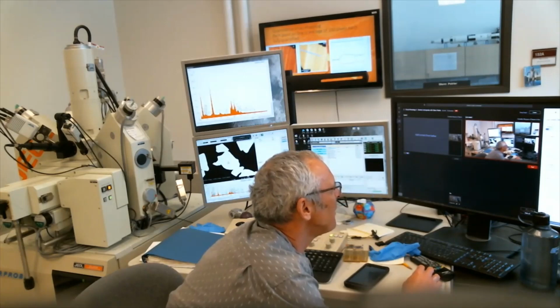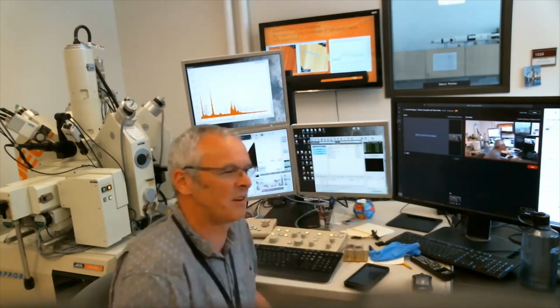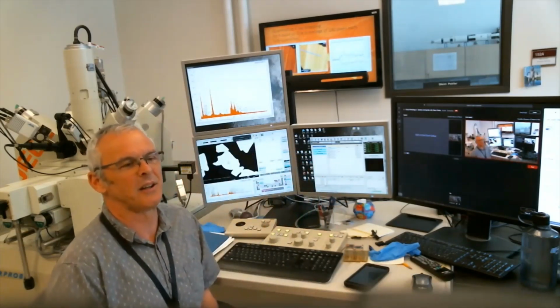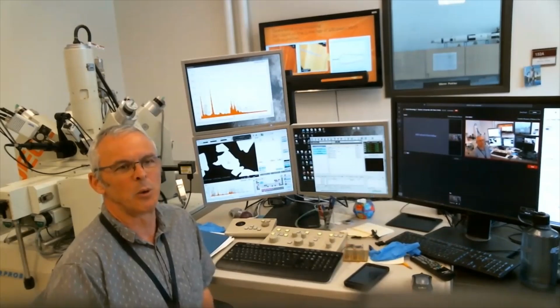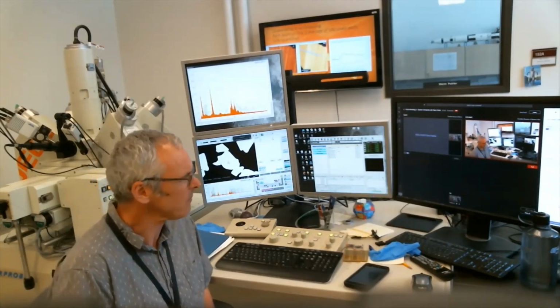Okay, yeah, I understand the delays with 60 seconds. Brad wants to know if you get results in mole percent for the unknown. Of course, that's just a simple calculation. So yes, we can turn the output into mole percents very easily. It's just a question of doing some chemical calculations.